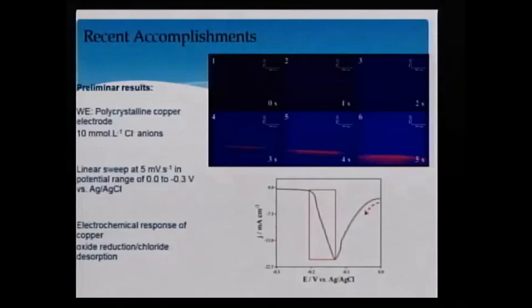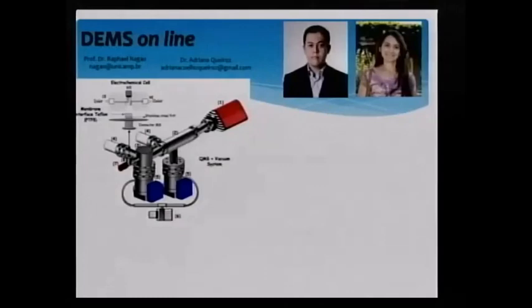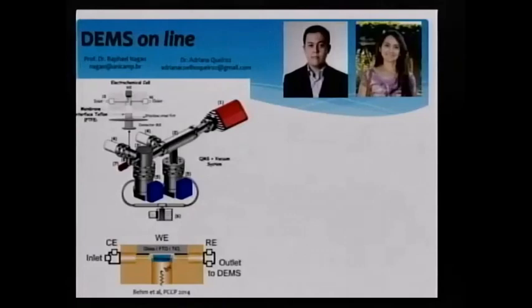Then again, Rafael with Adriana, they have set up a DEMS. It is to follow a gaseous product. When you form gases, you can monitor them with this tool. You have one here on the first floor. Adriana worked with Professor Fabio Lima, and now is with us, and has recently set up this tool at the University of Campinas.